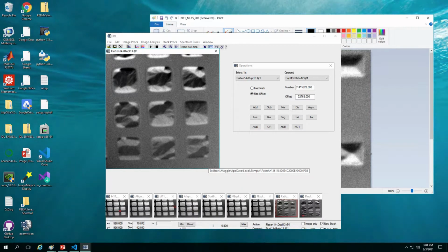But we also see that, from top to bottom in this example, it doesn't have a very nice gradient. Here it's brighter and here it's darker. For now, I think it works for us.